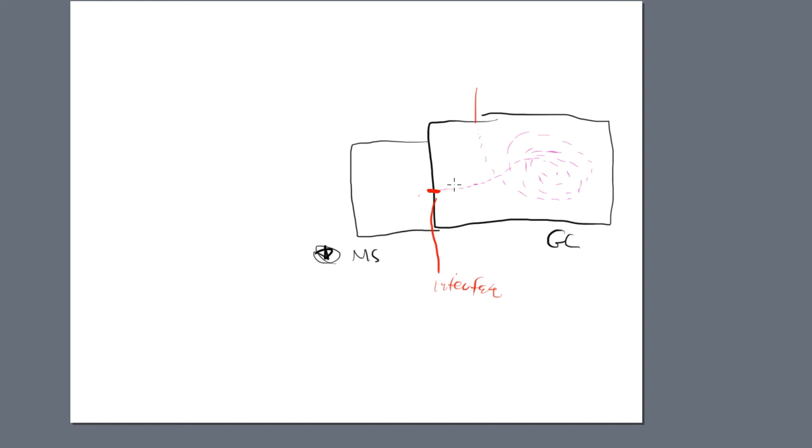The component getting ready to come off, if it has a very high boiling point, has a chance to condense back in the interface and turn back into a liquid and never leave, unless we heat that interface up to a hot temperature to get it out. This is the problem that we are going to see in the gas chromatography world. Temperatures, which directly relate to boiling points, play a very important role.